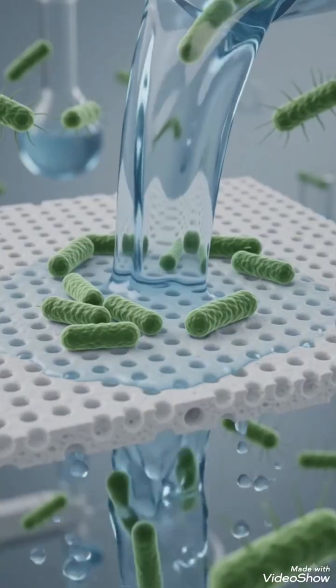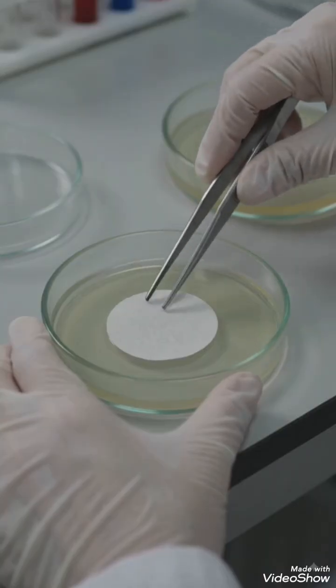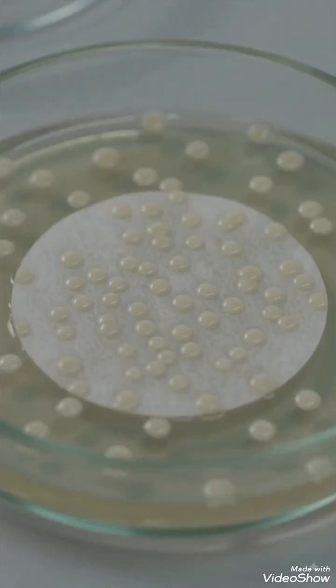The membrane filtration method is based on physical retention of microorganisms. A sterile membrane filter with pore size 0.45 micrometer traps bacteria while allowing water to pass through. After filtration, the membrane is then placed on nutrient medium. Trapped bacteria grow into colonies.